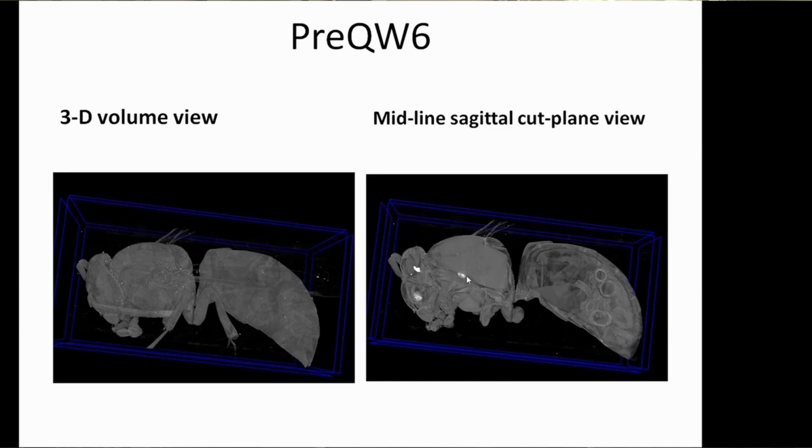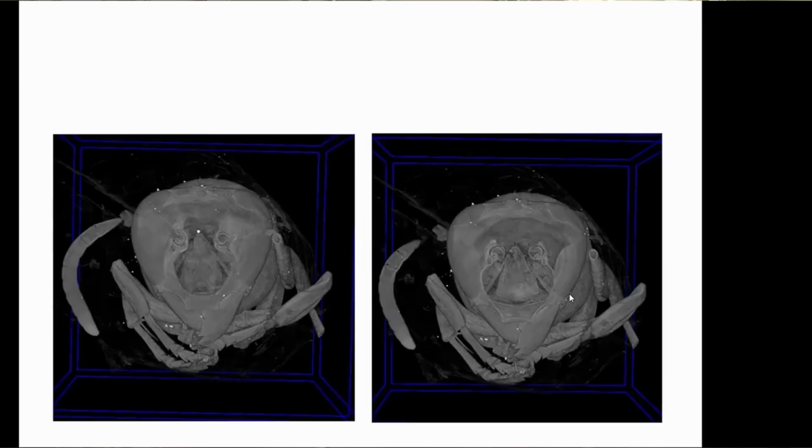There's also material stuck in the esophagus halfway down the thorax, and in a moment we'll see there's all sorts of mayhem happening in the abdomen. So if we start at the front of the wasp and cut serially back towards the wasp's waist, here we're seeing the pharynx.